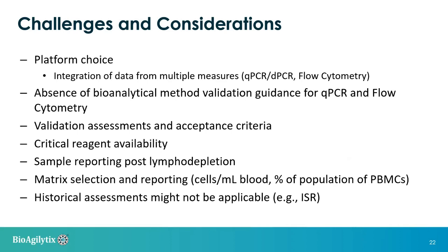I mentioned that flow cytometry and PCR can both be used for cell therapy pharmacokinetics or cellular kinetics characterization. It's also challenging and difficult when you're measuring these by these very different platforms and trying to understand the concordance of results and the differences in reportables.